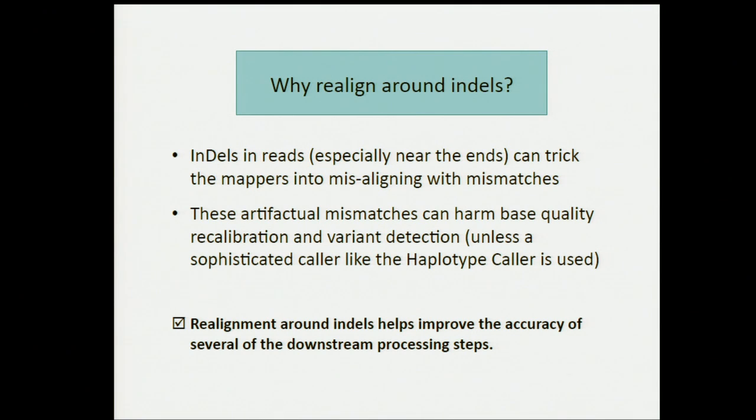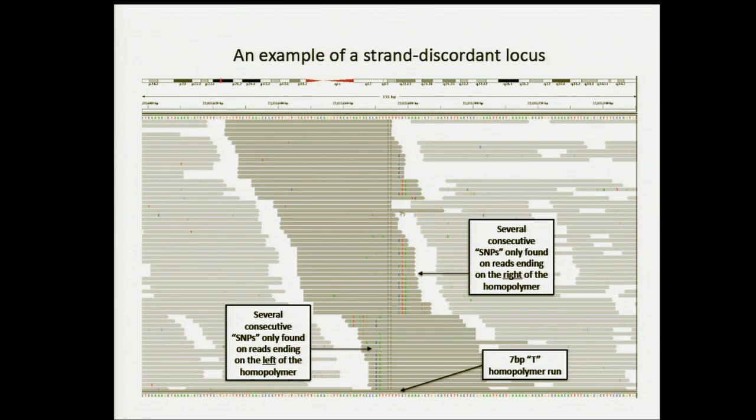Better than explaining this in words, I'm going to show you a screenshot in one second, an IGV screenshot that will exactly describe this. I hope that's not too blurry. I'm going to try to use the pointer to show you these things. So again, this is your IGV screenshot. There's lots of gray, lots of matches to the reference. But you see a whole bunch of columns here with these mismatches.